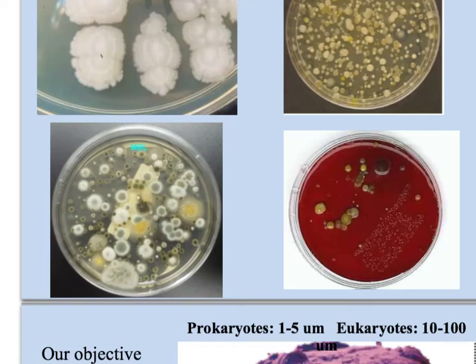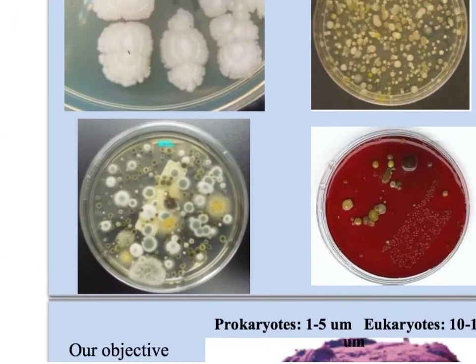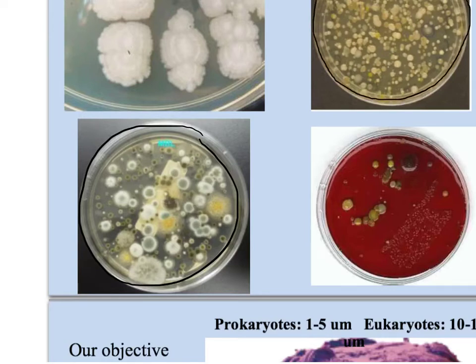Okay, so for those of you who are in class today, we started our disinfectant lab experiment, and we took samples of the bacteria and stuff growing on the bottom of our shoes, and we are going to culture it on these plates. That's what these are, and we're going to see it grow. So these are what our plates should look like within the next 2 days.